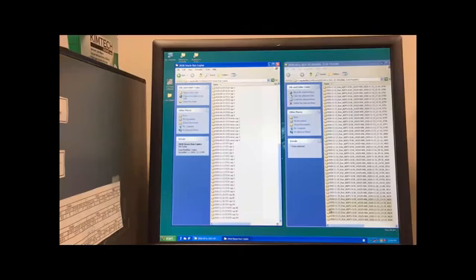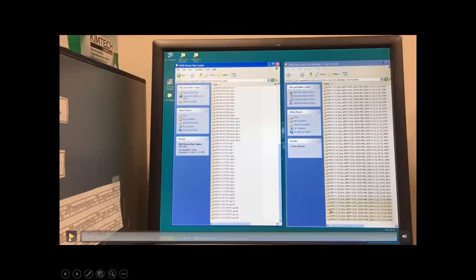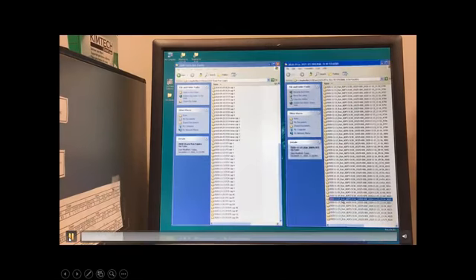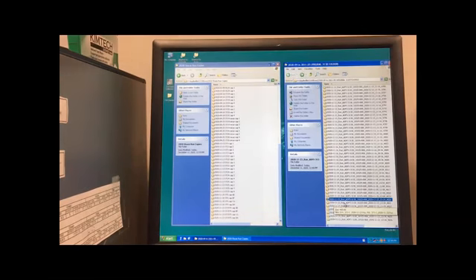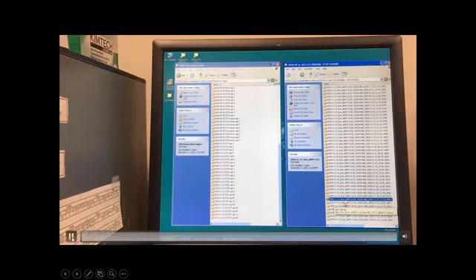Okay. All right, so we go back and we need to copy. We want to leave those original folders. We don't want to move them. We don't want to cut them. We want to copy those files into the proper new folder that we just created. All right, so how are we going to do that? Well, I think I messed up that video a little bit.